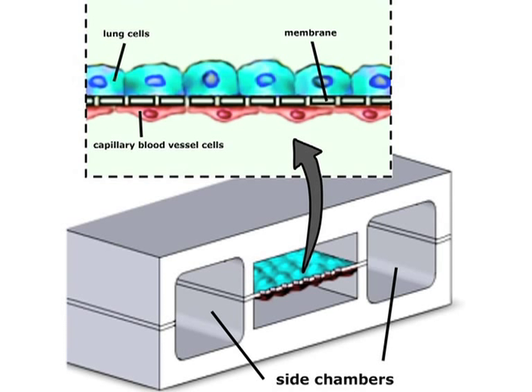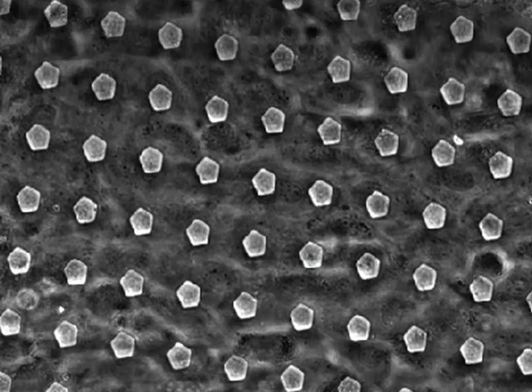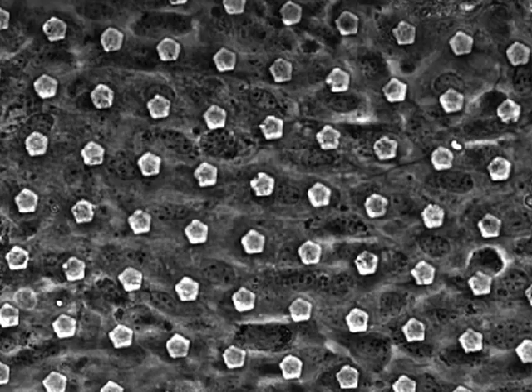And so we recreated this using microengineering techniques by making small channels in this flexible material that are lined by airway cells and capillary blood vessel cells, and they share a common membrane that's flexible and porous. And we're able to apply suction into neighboring channels that makes us stretch and release, and it literally mimics what the lung cells experience when we breathe. It's this ability to combine all of these different features in this little flexible device that we see in the whole lung that allows us to predict results that we actually show we can confirm in animal studies.